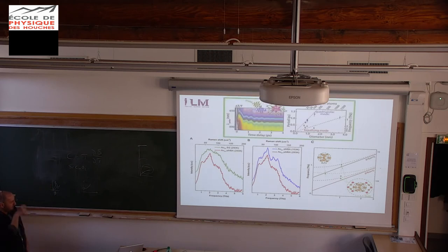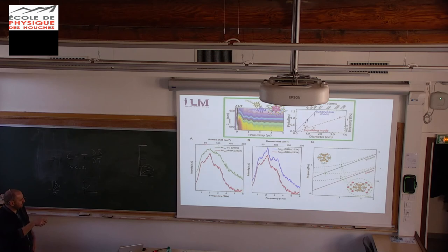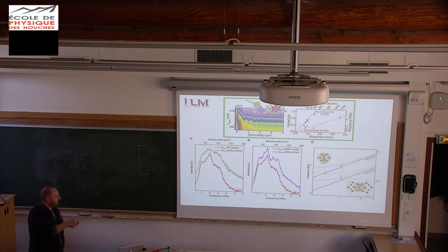This is the same structure as Natalia showed you Saturday. We measure it in Raman, we measure the same point. That's a good point, we measure the same frequency, and we have another frequency in our case. As we think that the ligand has an effect, we asked the chemist to change the types of ligands we use, and the spectra change a little bit. We think that is due to the way the ligands are put outside the aggregates, but we don't know yet. You see this mode in between here is due to the core of this structure.